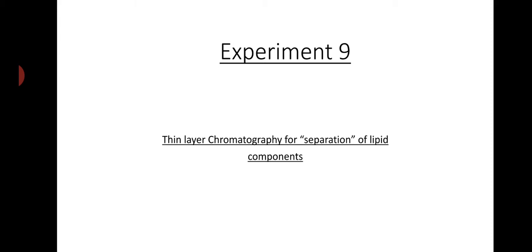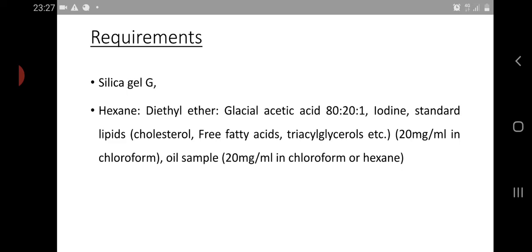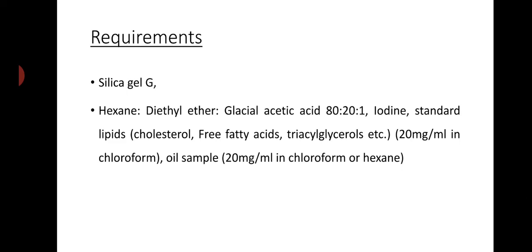So you need to focus on one thing, that this is the first chromatography technique you are going to do. You will learn many chromatographic techniques in coming years. This is the easiest one, thin layer chromatography, also written as TLC. Again, there are certain requirements. They are also available in your lab manual, so no need to be worried too much. I'm writing it over here on the PPT, but you can see it in the lab manual also.